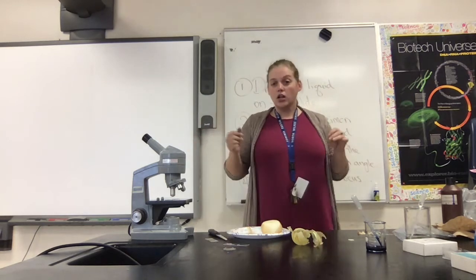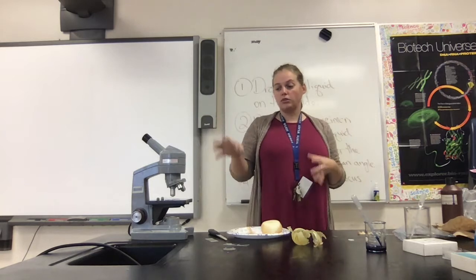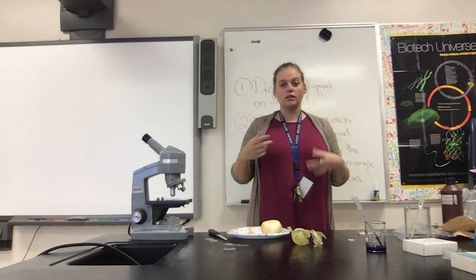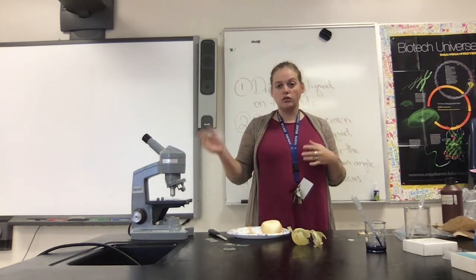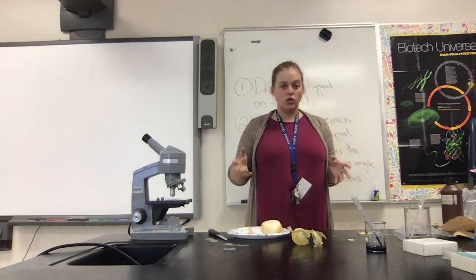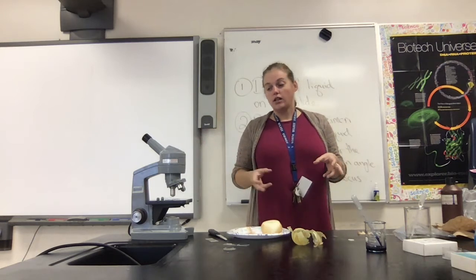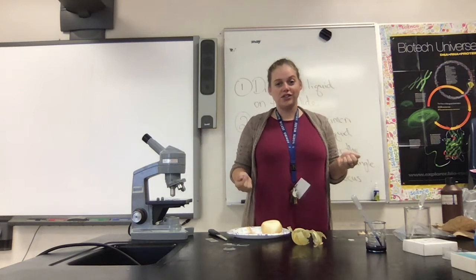I'm going to focus these microscopes on these cells, take a few pictures from low to medium to high power, and then we'll talk about these different kinds of cells that you're seeing.